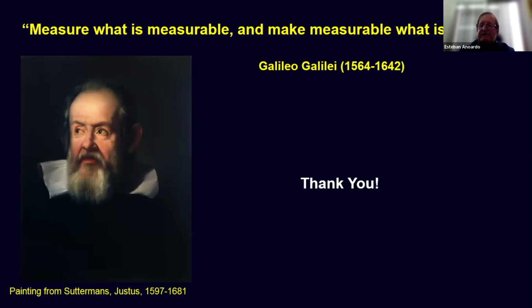The calibration of the machine is an important point for everyone. And the only way to do this, what is standardly accepted in the metrological ambient, let's say, is with an inter-laboratory experiment. Using exactly the same sample, you have to check that all the parameters of the machine are correct, and you have to check some things in the machine that a standard user cannot do.